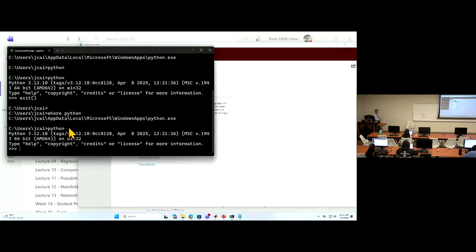It's already installed, but I wasn't able to find where it is installed. But now I've come up with a solution for how it is set up. I had Python 3.12 installed, which is located in this place. So that's the information you need to set up.